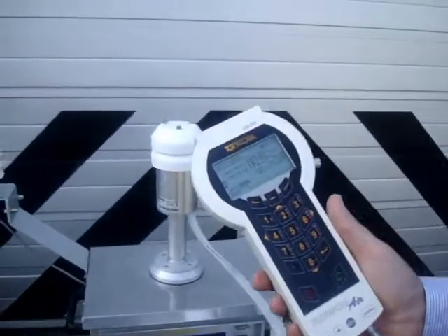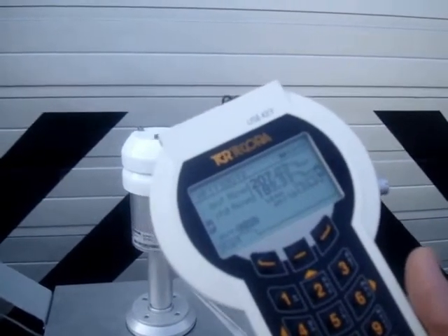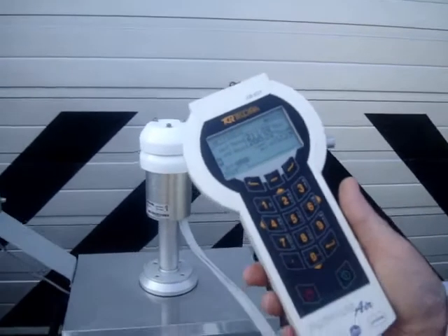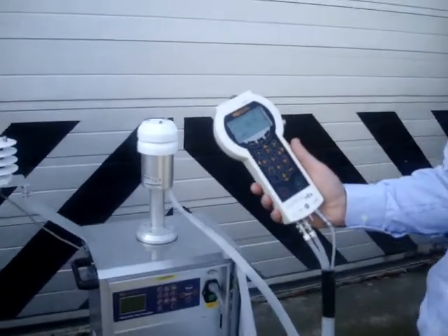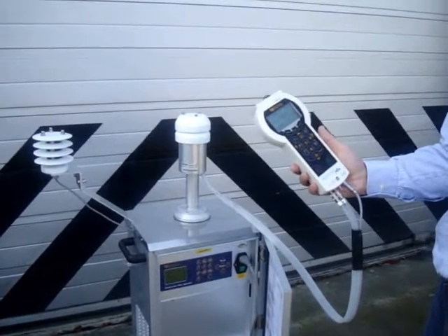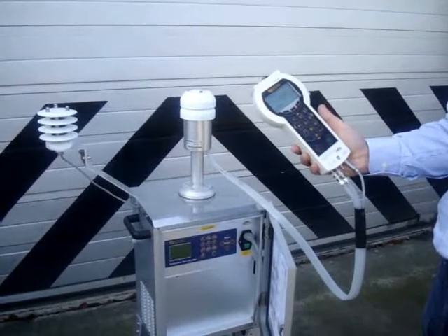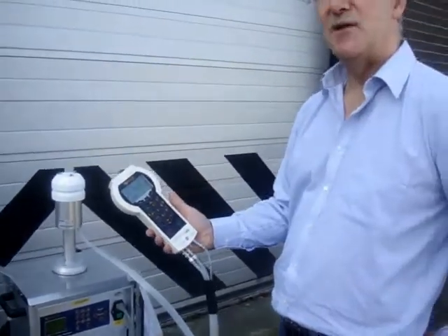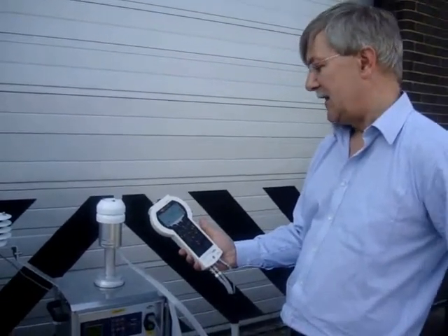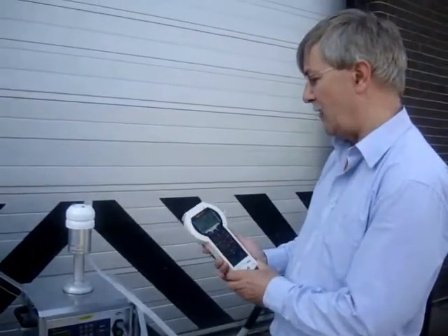Air samplers are designed to run at a fixed flow rate, so it's not necessary to check the flow across the range. You simply want to verify that the flow rate is drawn correctly. In this case, the target flow rate is 200 litres per minute. Allow a few minutes for the flow rate to stabilise on the sampler, and the sampler displays the current air flow rate continuously.